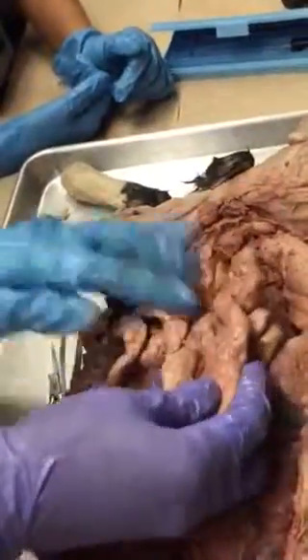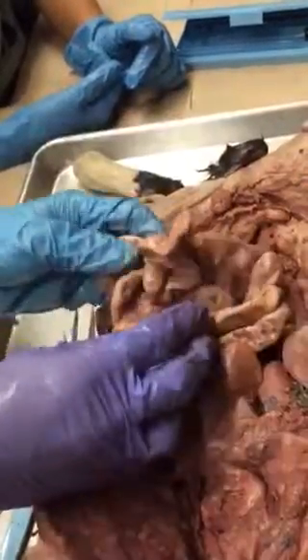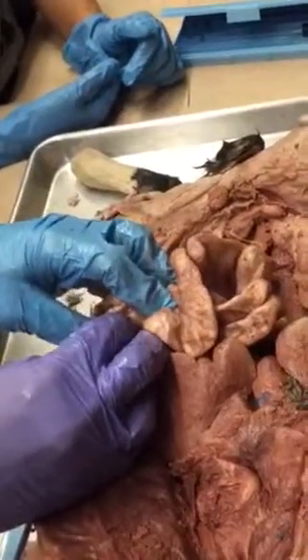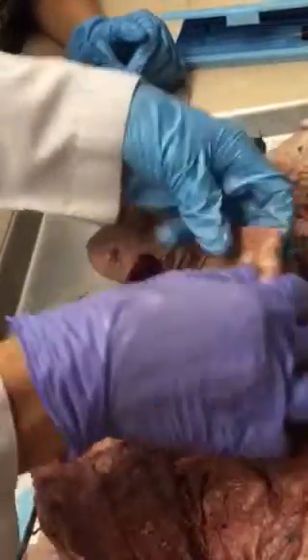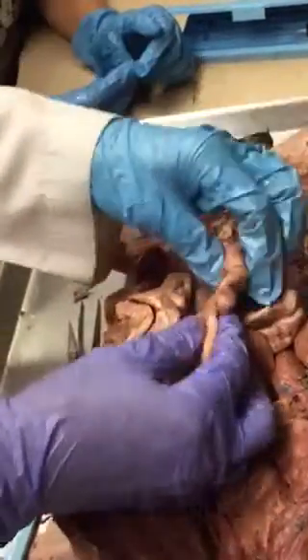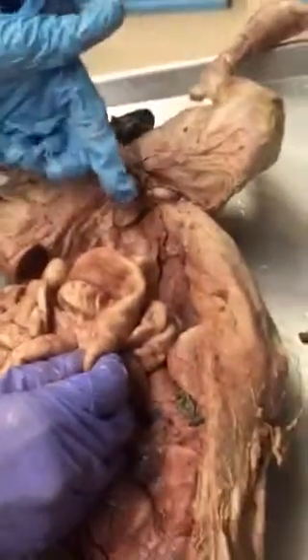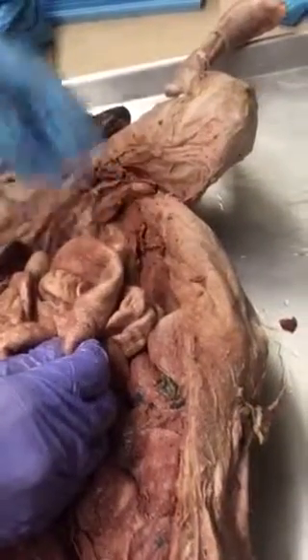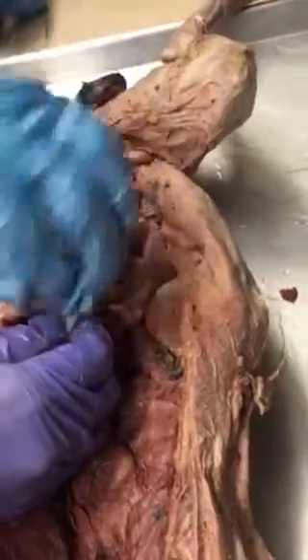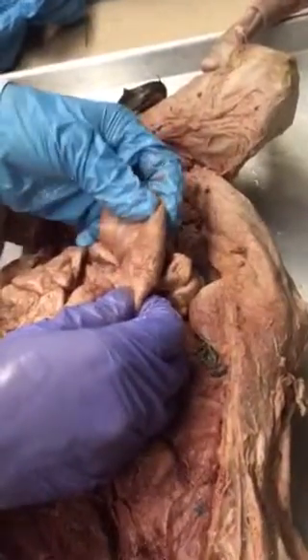Okay, so small intestine. If I said, identify this organ in general, you'd say small intestine. All right. The large intestine, again, is the big tube. It's very short in the cat. So it just goes from here to here. In human beings, there's an ascending colon, a transverse colon, a descending colon, a sigmoid colon. It's much longer. In the cat, it's just this little bit here. But again, large tube tells you it's large intestine.